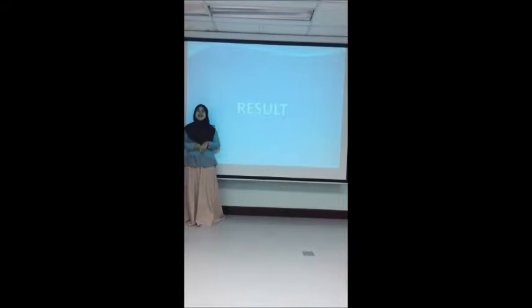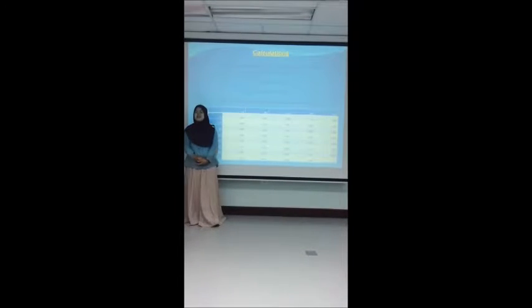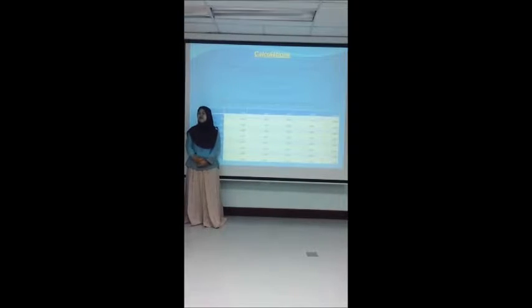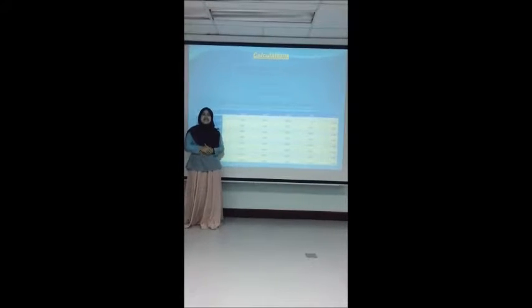Assalamualaikum and hi. My name is Nashira binti Abdul Rahman and I would like to present the results from our experiment. For the experiment, we get the values of the absorbance. The absorbance values can be put into the data as you can see here. Then from the absorbance, we need to convert it into concentration. The concentration can be obtained from the linear equation of the theoretical graph, which is y = 0.098x + 0.051. The value of x is our concentration.